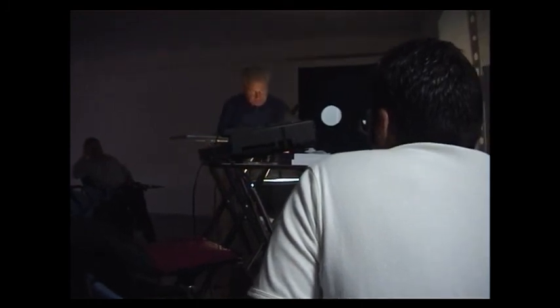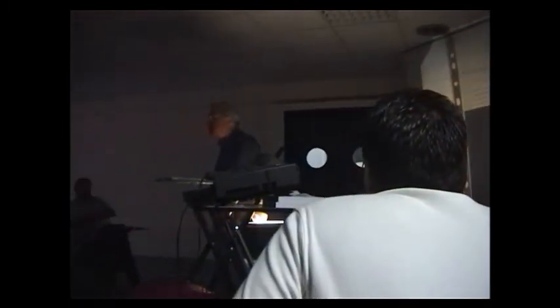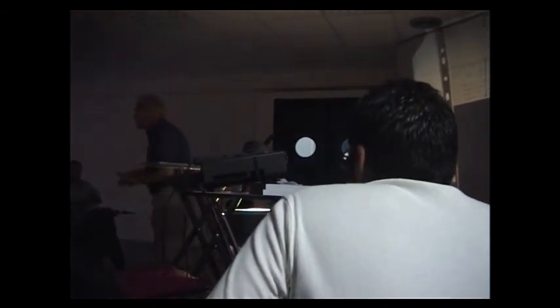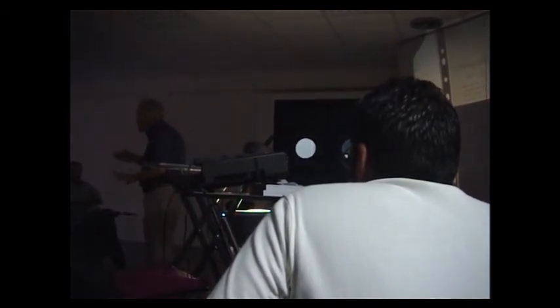A second point is that this energy loss is proportional also to the atomic number of the target over the atomic weight of the target, Z2 over A2. And this ratio is decreasing with the atomic number.